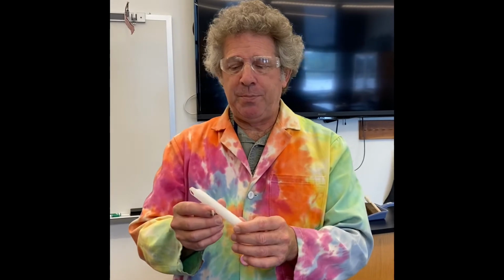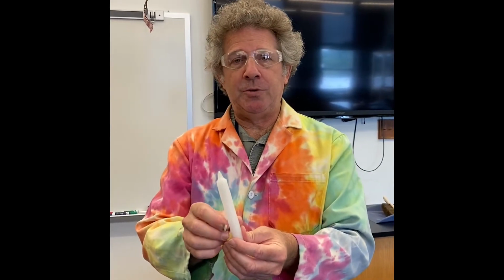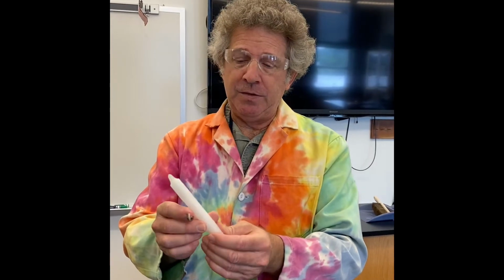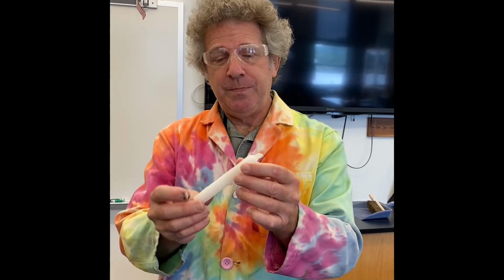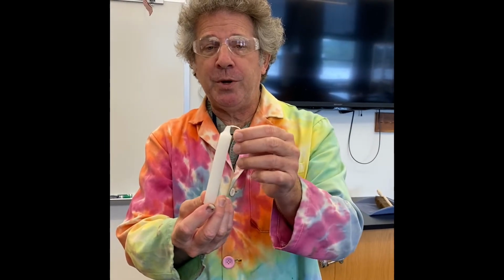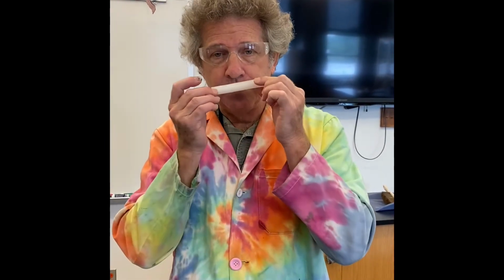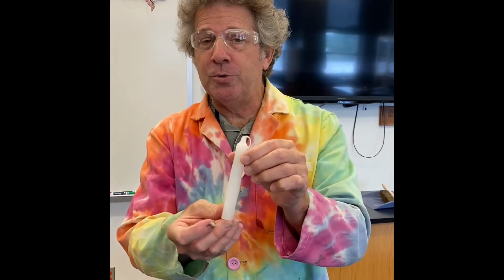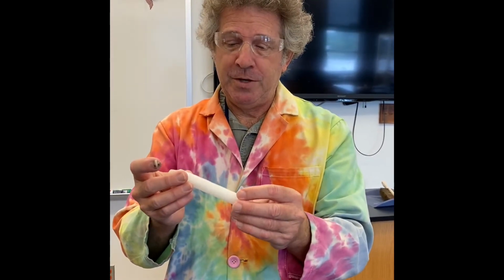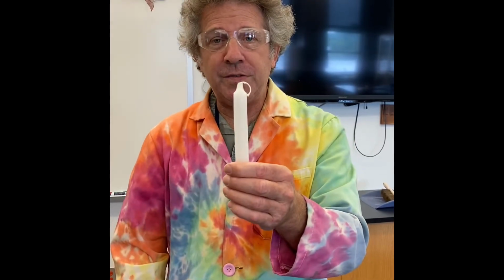Okay, first up is to examine the candle and look at it, describe it. It is smooth, it is kind of cylinder in shape, except for the top part where the wick is. It is odorless, it is a solid, and it's waxy.